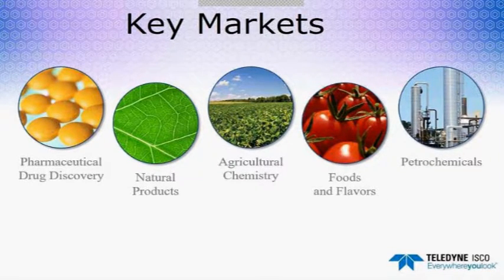kind of eats itself. Silica dissolves under basic conditions, so the amine functional columns do have a bit of a lifetime. But I've kept the columns stored in 2-propanol, and I've been able to use them after a year and still get good results. One other thing I neglected to mention with the amine column is absolutely do not use an acidic modifier. The acid has an anion in it, and if you add an anion to the amine column, you've converted it to an ion exchange column, and it won't work anymore as an amine column.